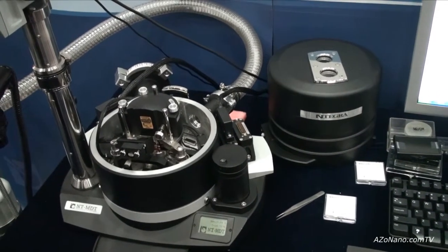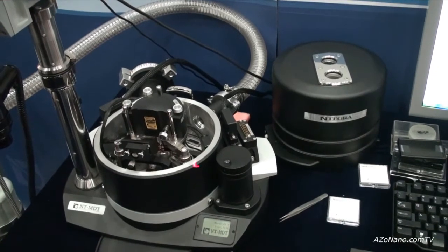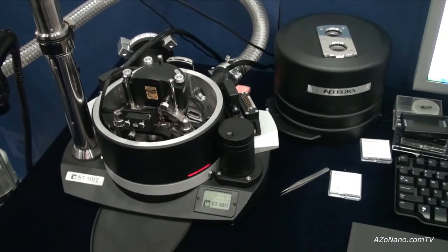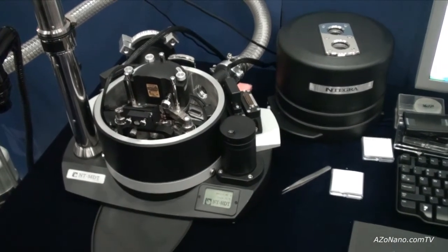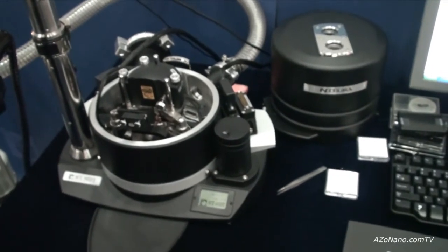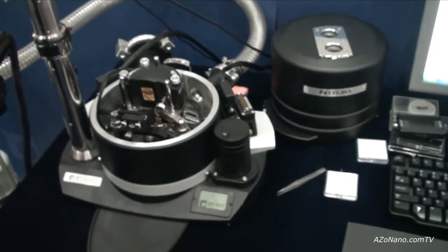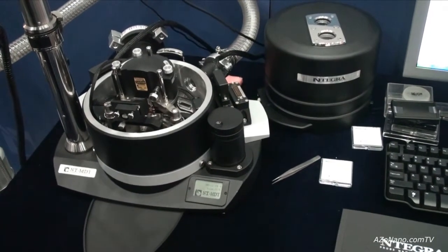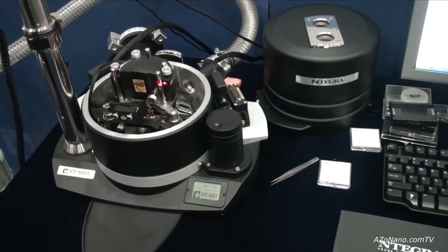This drift is available due to the special materials we are using in this Integra system. All these parts are titanium, which has the lowest thermal drift because of the very low thermal expansion coefficient. And you see the symmetry of this system. This symmetry together with the best materials and with a fully closed loop control.